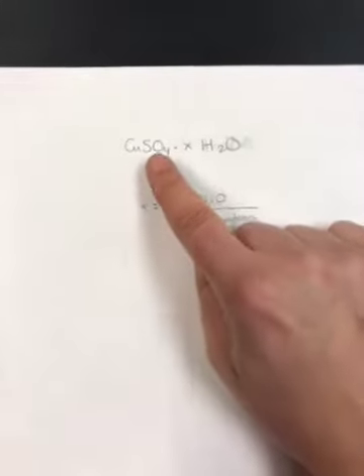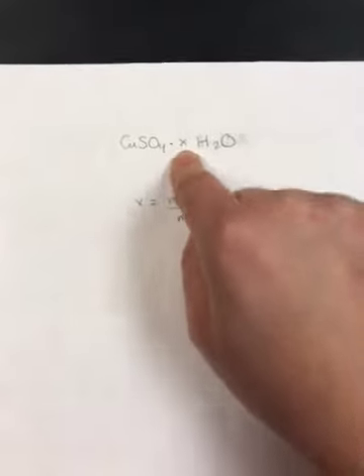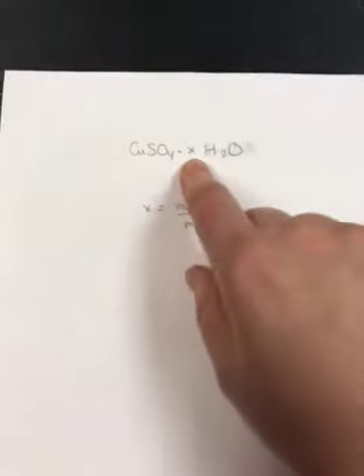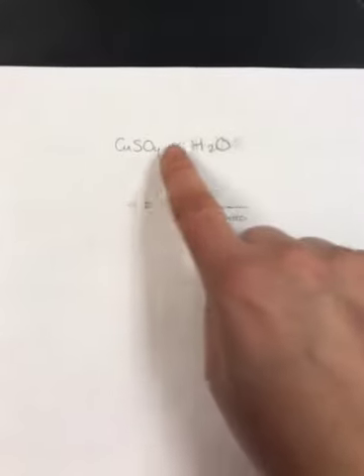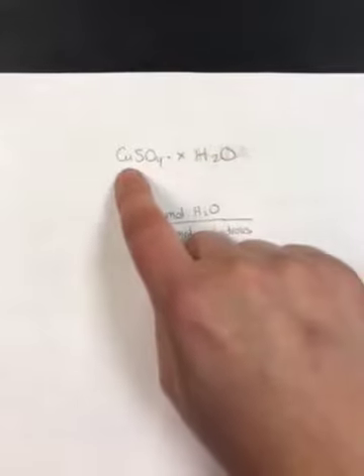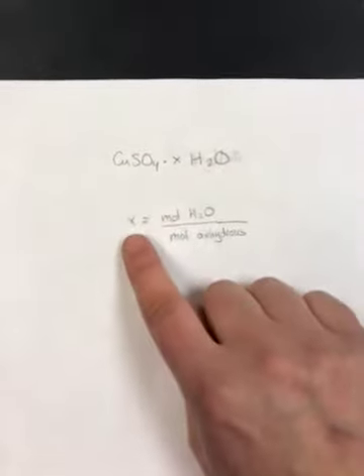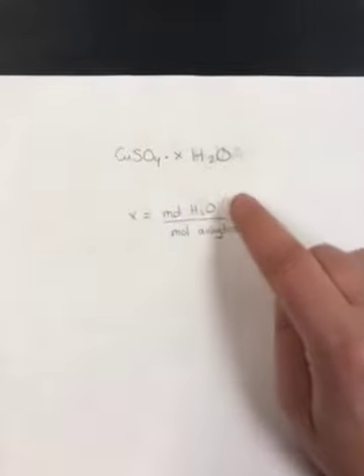So basically, the goal of this lab is to determine what X is. It could be 2, it could be 4, it could be 5, it could be any number here. And so we're trying to find the formula of the hydrate by finding that X. Well, that X is the ratio of the moles of water to the moles of the anhydrous. It's how many moles of water for every mole of anhydrous. So to find the X, we need to take the moles of water divided by the moles of anhydrous. So how do we do that?